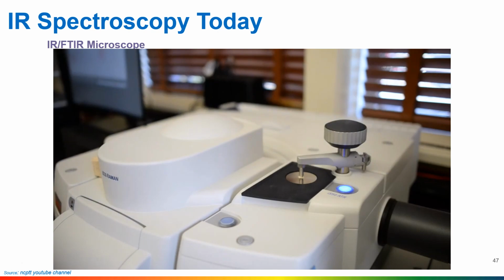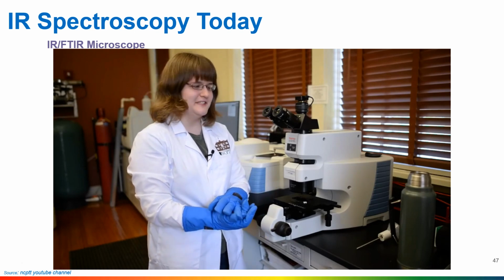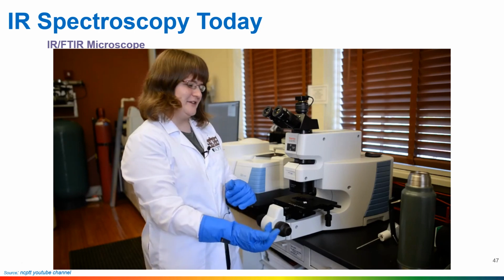And I press that button there so we can run and get the spectrum, which you'll be seeing on the computer later. So now I'm going to be using the microscope, and the first step that I'm going to be doing is adding the liquid nitrogen.